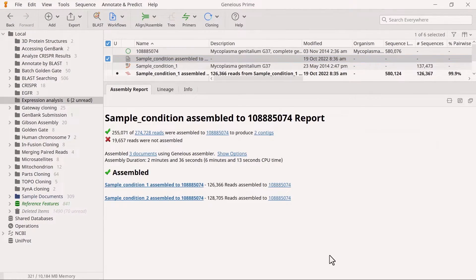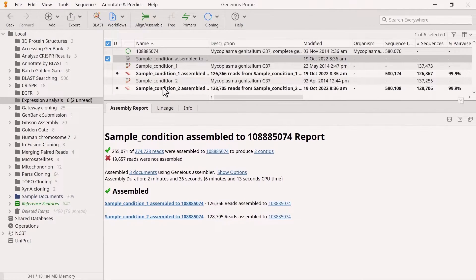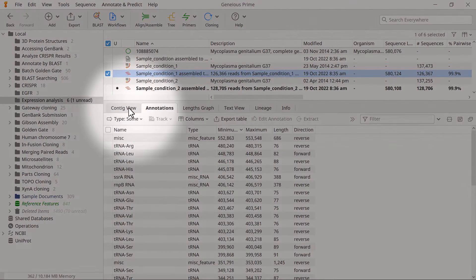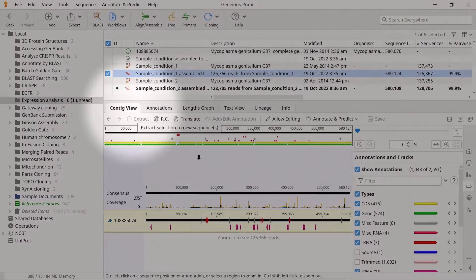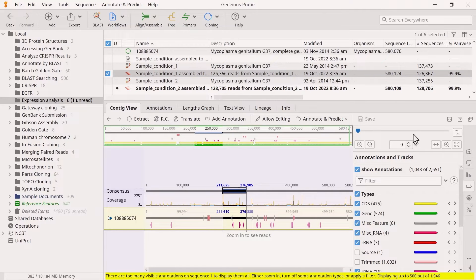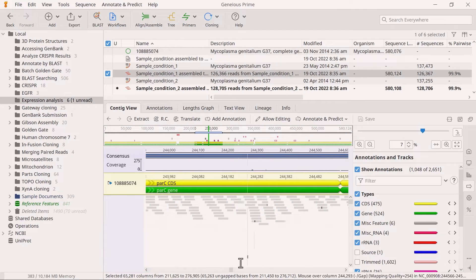The resulting assembly report summarises the analysis, including the number of reads assembled and not assembled. There are also two assembly files returned. You can zoom in and pan around the sequence on the contig view to see the aligned reads.